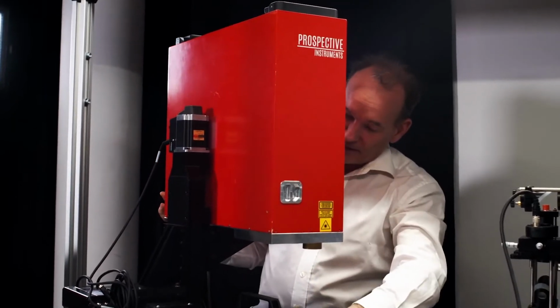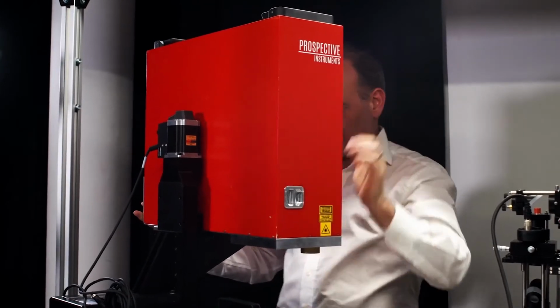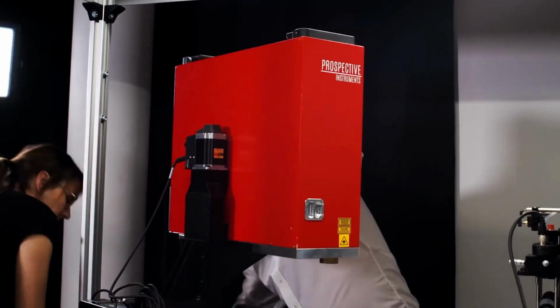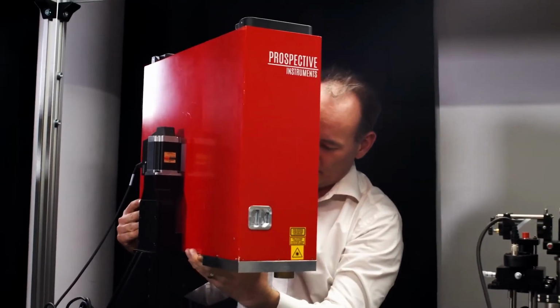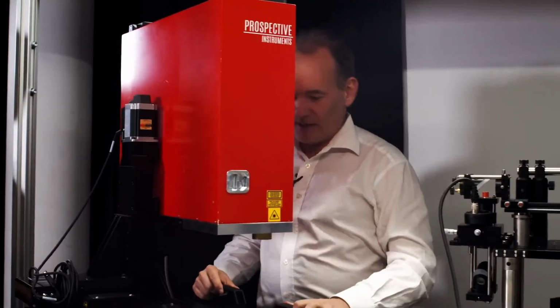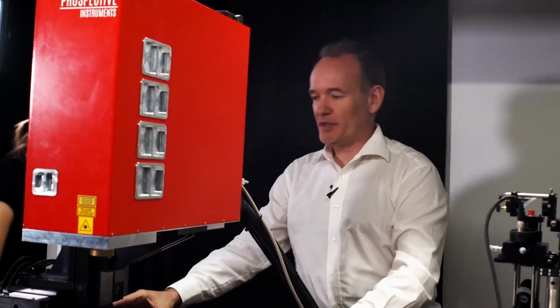So we do have some mechanical stops here. Actually, that helps you to get the scan head fixed to the support from Saber. Very good. So we are nearly set up. We're going to move the microscope forward a little bit so you can have a better view on it.